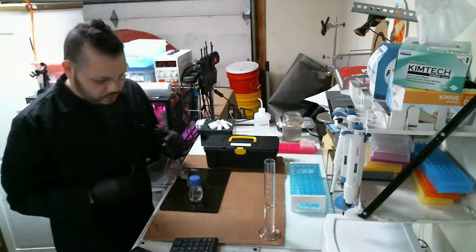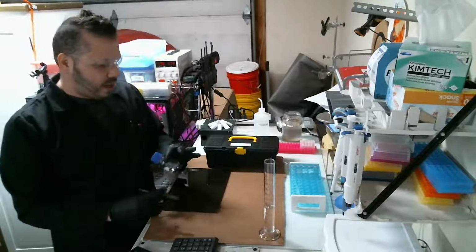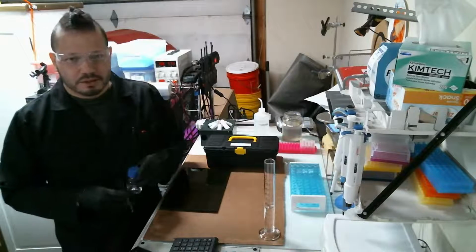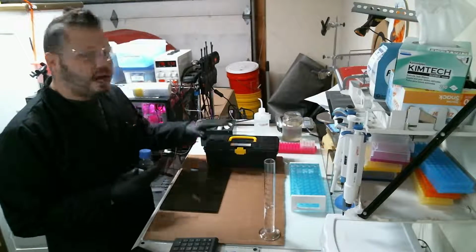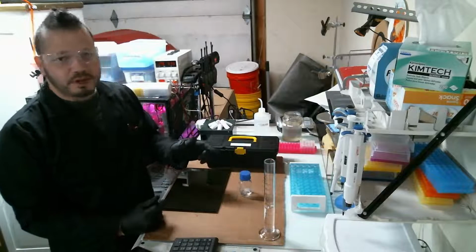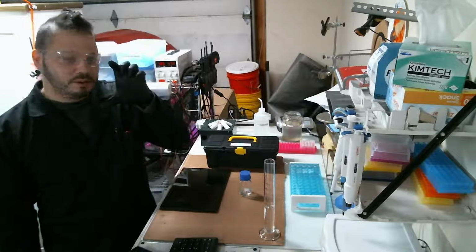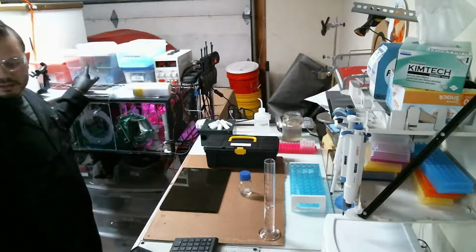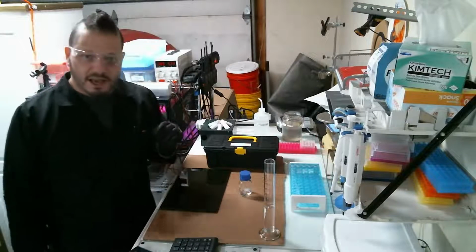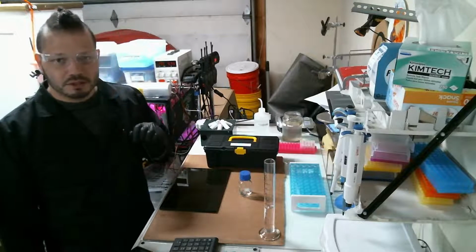Hello everyone. So recently I just uploaded a video today where I talk about how I have to change my algae hormone experiment. That requires diluting my stock solution to an even lower concentration, because for the next experiment I'm doing, I essentially need 1 microgram for one of these vials, or centrifuge tubes, per 15 milliliters. And there's no way I can actually measure that amount properly to do the experiment.